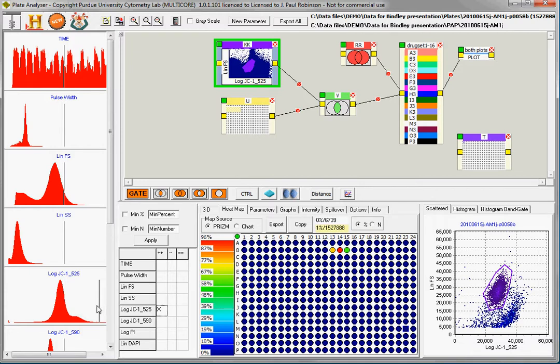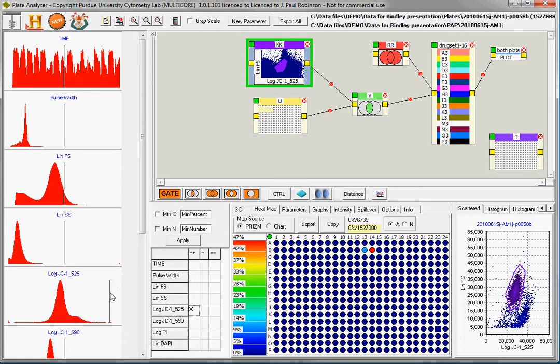And if I do that and I move this way up in here, in fact the cursor's now sort of hiding, you can see that it's now 6%, but I can still see a 6% sample. Now if I go back to 100%, very difficult to see these. So that's just a little point there.